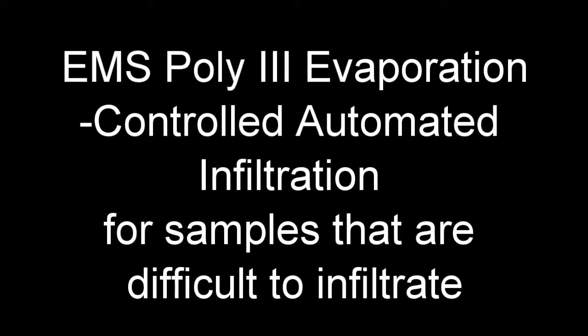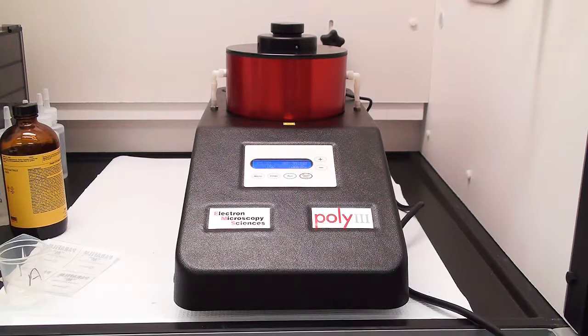In this video, we're going to look at the EMS Poly-3, which is an automated evaporation infiltration unit especially designed for difficult to infiltrate samples.